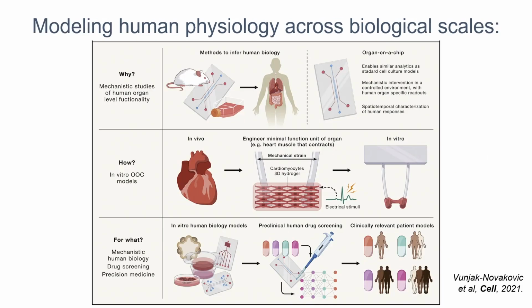What turned out to be the case is that actually this effort of serving the drug development had much broader impact than originally envisioned. And actually the MPS turned into an effort of modeling human physiology across different biological scales in a way that is serving both the science and many, many branches of medicine, not only drug development, not only regenerative medicine, but also our understanding and treatment of different kinds of diseases.